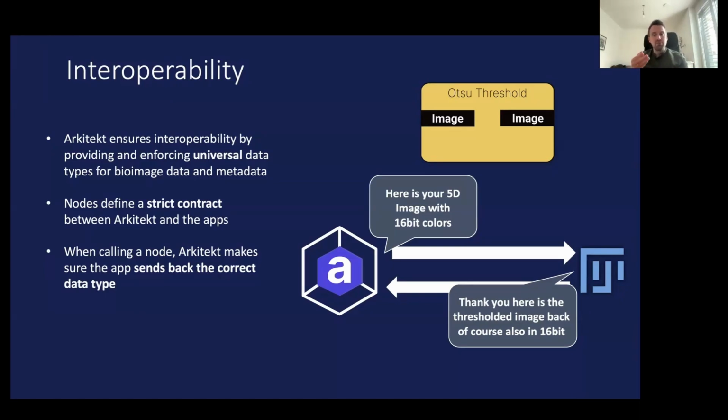You could run what you mentioned before, this step where you load an image in, you run whatever you want, and then you have it out. That is possible. And you say, my input is an image and my output is an image, and in between I do what I want. But what I really would like is to have more fine-grained control. Say, I run this plugin. And right now I had to write major parts of this, to wrap it with one line of code to say what the plugin actually does. And that needs to happen. But there are efforts to run, for example, Nextflow or Galaxy plugins and have that definition as part of the Arkitekt definition. But right now it needs to happen by hand, pretty much, or be programmed.